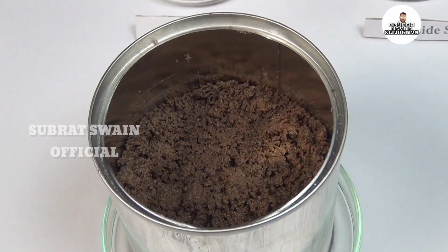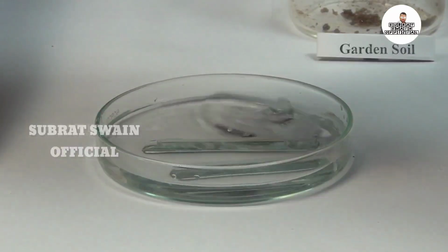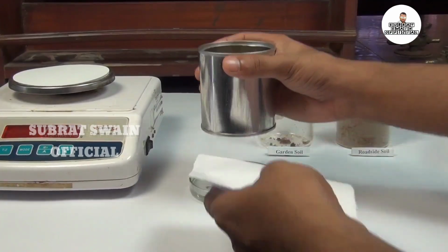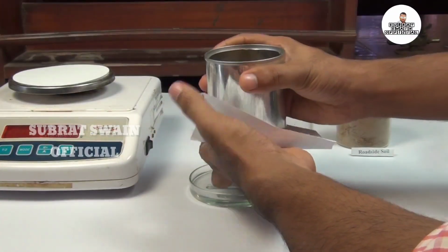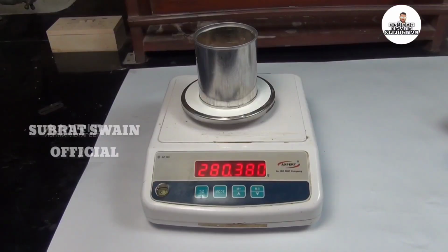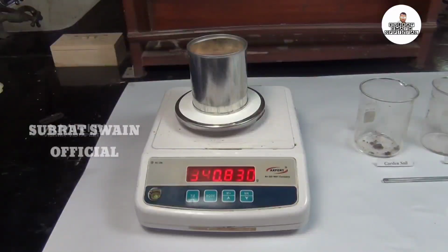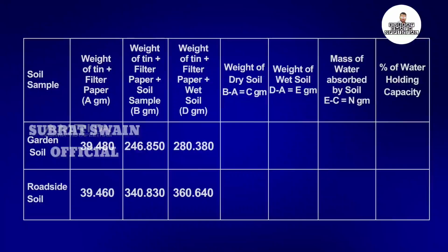Wait till the entire soil surface is wet. Remove the tin and allow all the gravitational water to flow out from the bottom. When no more water percolates, wipe the bottom and dry it with a filter paper. Weigh again and note its weight. Similarly, do the same procedure with roadside soil and record all the values into the table.